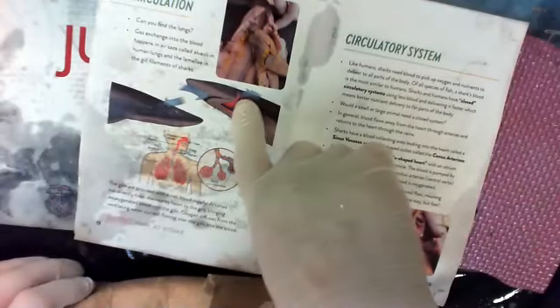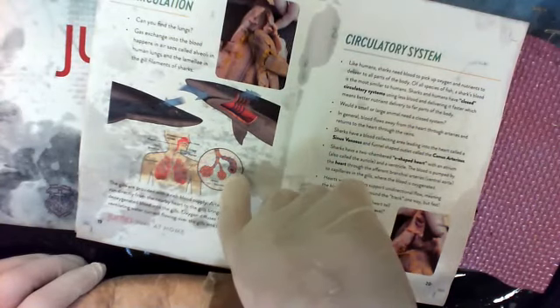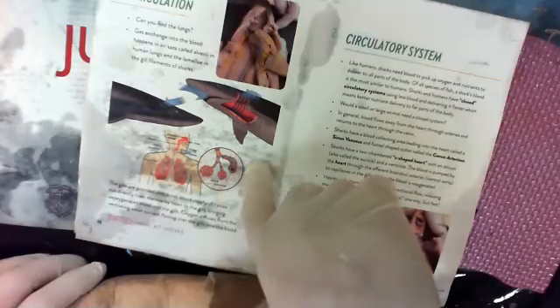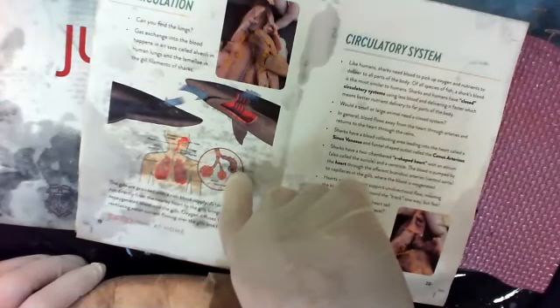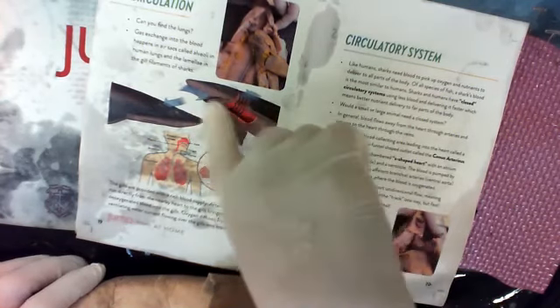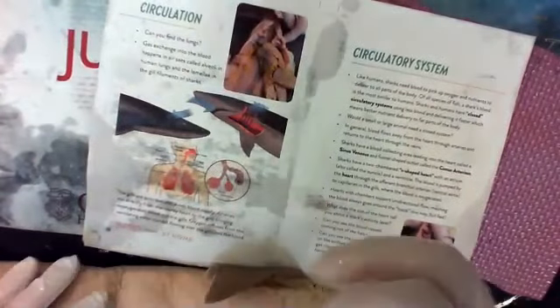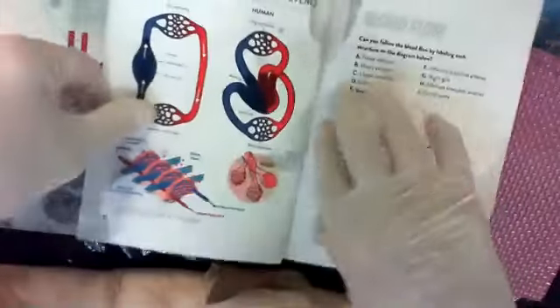So you can see they either bring it through the mouth, and it goes over the gills. We have to bring it down in our nose. We hold our breath for a part of a second, let the oxygen get into our lung tissue and go off into our blood vessels. You can see the blood vessels. Fish can't do that. They have to bring the water constantly flowing over because they can't hold the water on the gill to pull the oxygen out. It has to keep moving. So as we cut down, you'll see those little pages. This is awesome too. If we flip one more page, kind of moving right through.